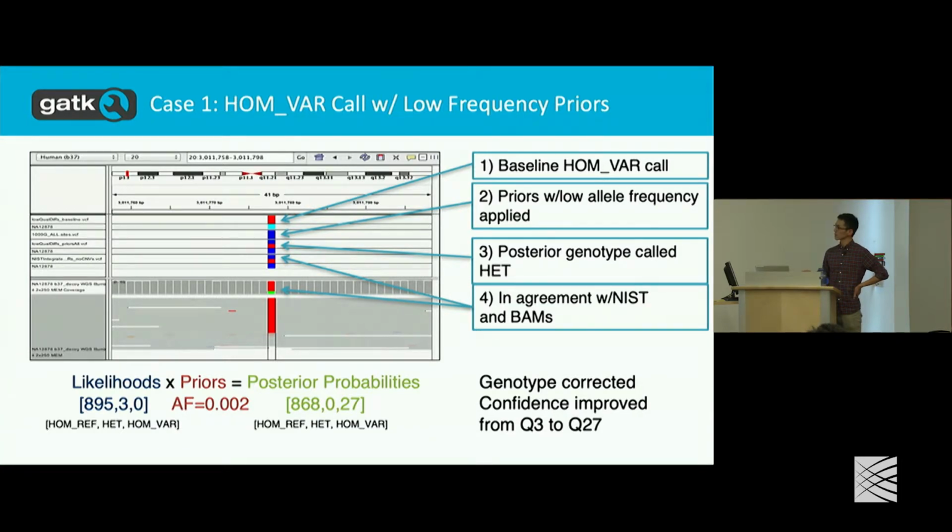And this particular sample happens to have a truth data set, and it actually agrees with the truth. So that's the correct call.